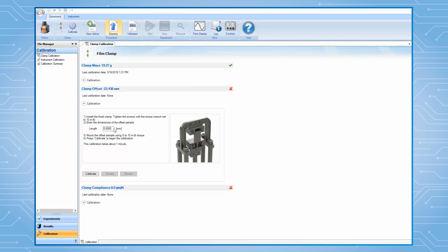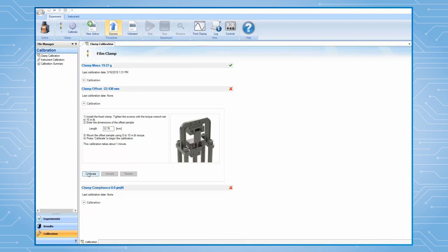Enter the length of the offset sample to the software. Then, press Calibrate to begin. After this calibration is finished, the offset value should be around 3-4 millimeters. Then, click on Accept.